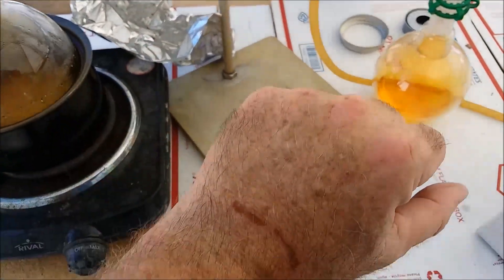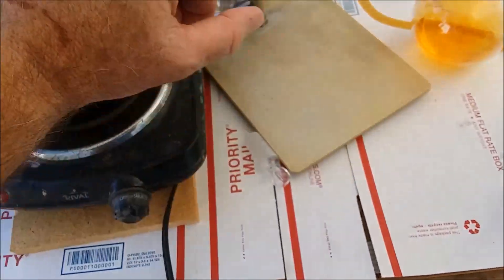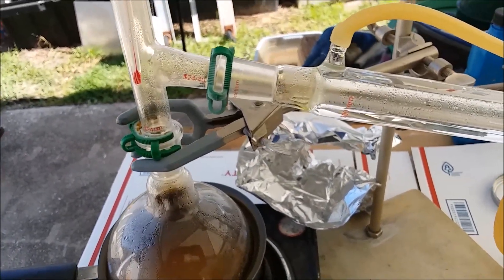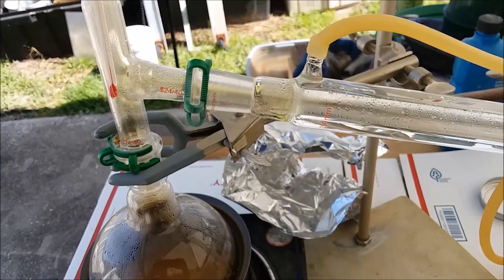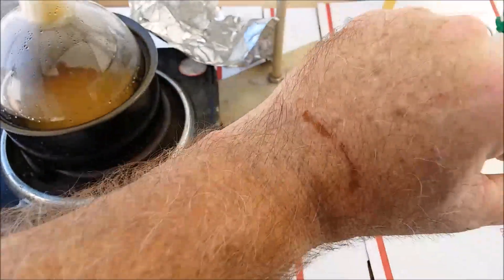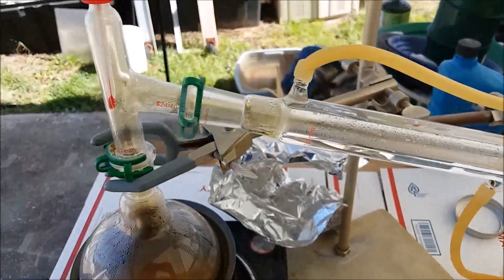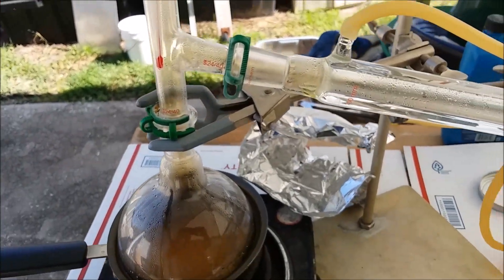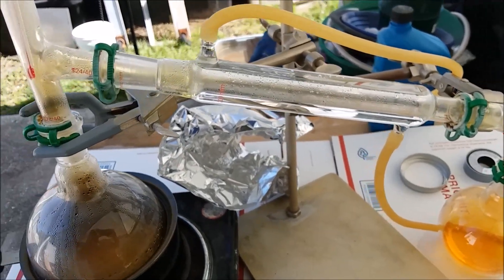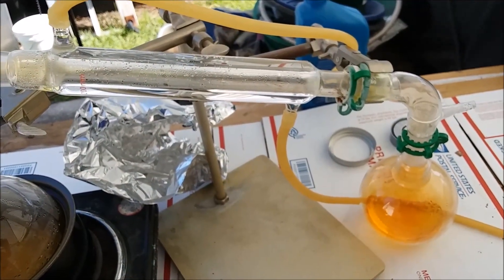I actually got a pretty bad burn from the nitric acid last time when I disassembled it. Somewhere up here when I was taking the condenser off, a drop of it somehow hit my skin. I didn't feel it at first, but boy I felt it after a minute or so. It's been about a week and it's still pretty nasty looking. So I'm definitely going to gear up.